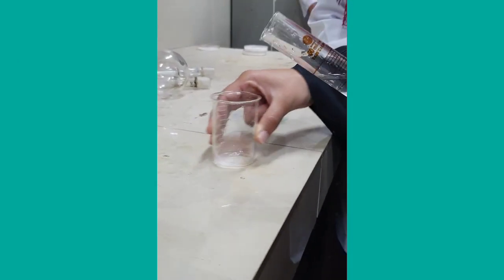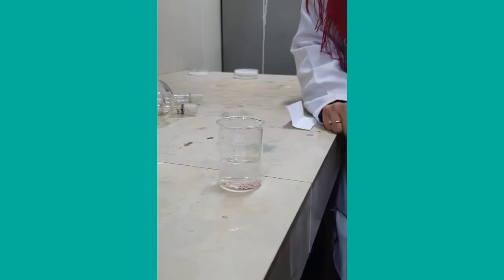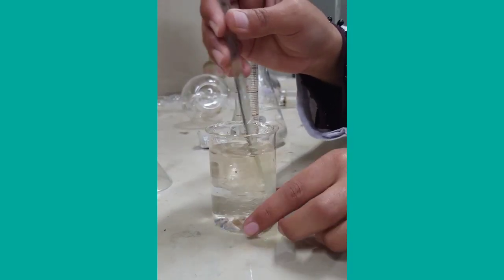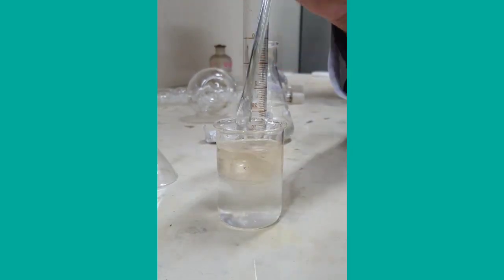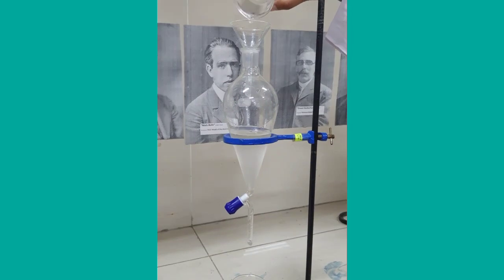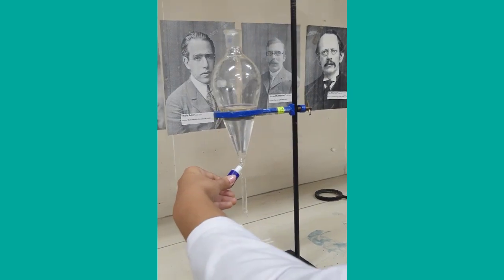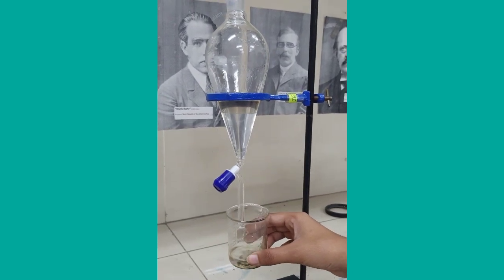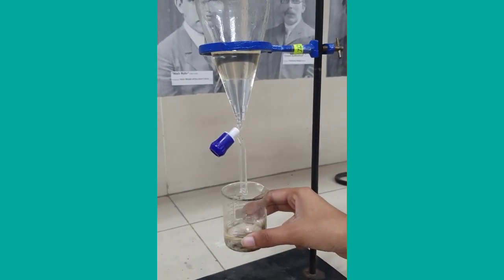Here we perform an experiment. Add 0.5 gram of sodium chloride and 0.5 gram of beta-naphthol in a beaker and mix them. Then add 50 milliliters of water and shake vigorously. Sodium chloride will dissolve in water, and beta-naphthol settles at the bottom and a suspension is formed. Now add 100 milliliters of ethyl acetate and stir it with a glass rod. Two layers are formed and beta-naphthol dissolves in ethyl acetate. Pour this mixture into a separating funnel. The aqueous layer will be formed at the bottom and the organic layer at the upper side. Separate these layers. The organic layer will contain beta-naphthol. By evaporating the organic solvent, beta-naphthol can be obtained.